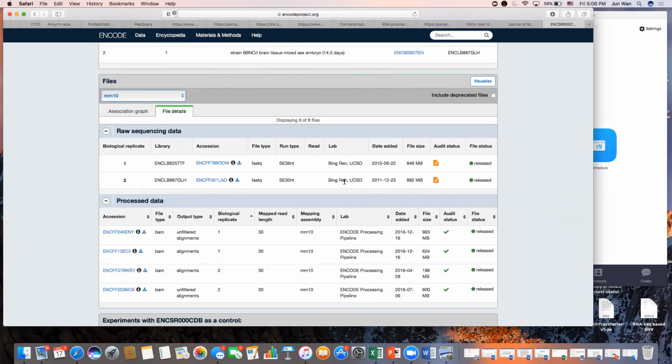Okay? And just directly download using wget or whatever avenue you'd like to do. apt-get, whatever you like. I use wget because it's straightforward and simple, and it just always works. But whatever you like, just get those files into your working directory, and then you'll be all set to go.